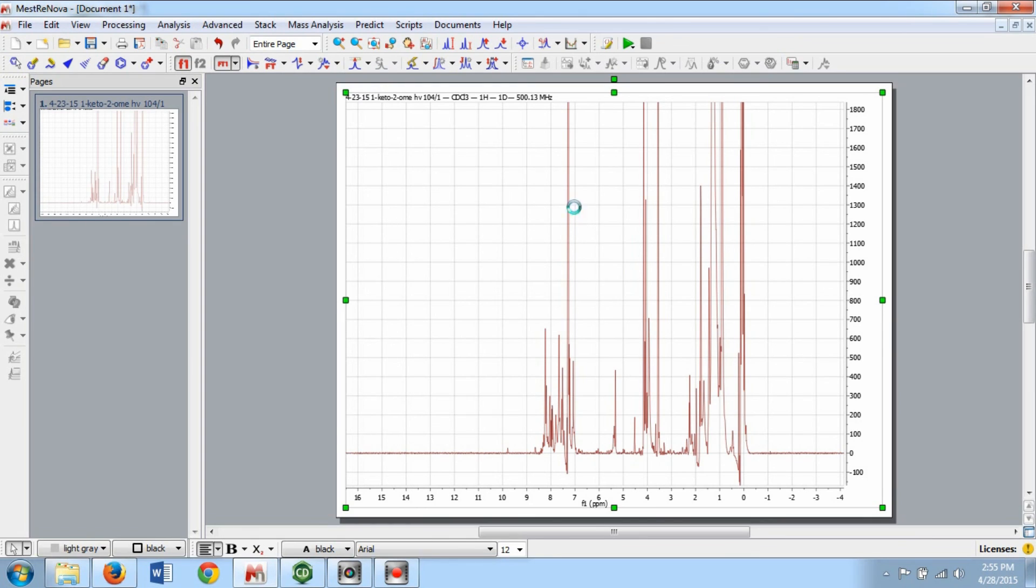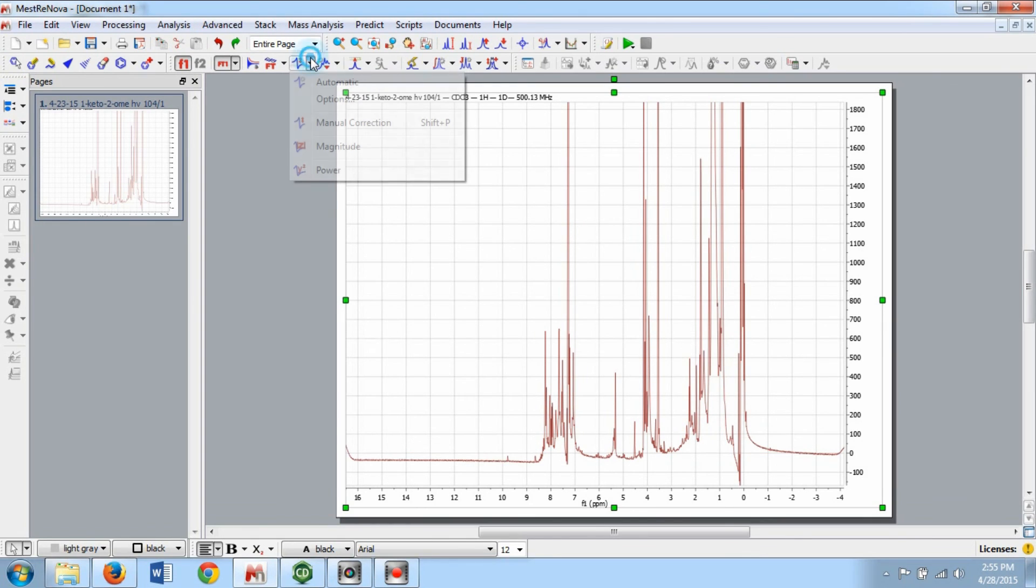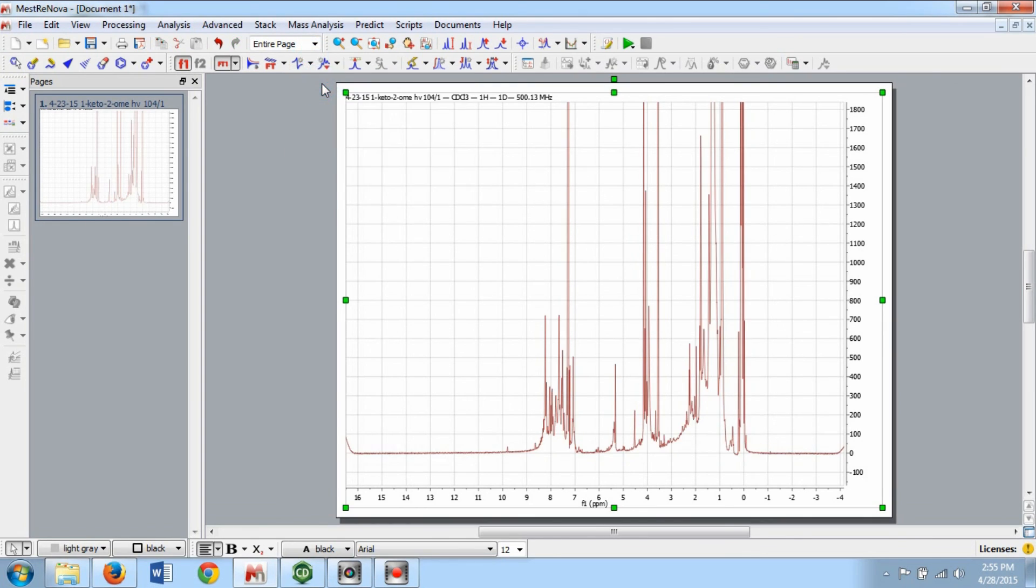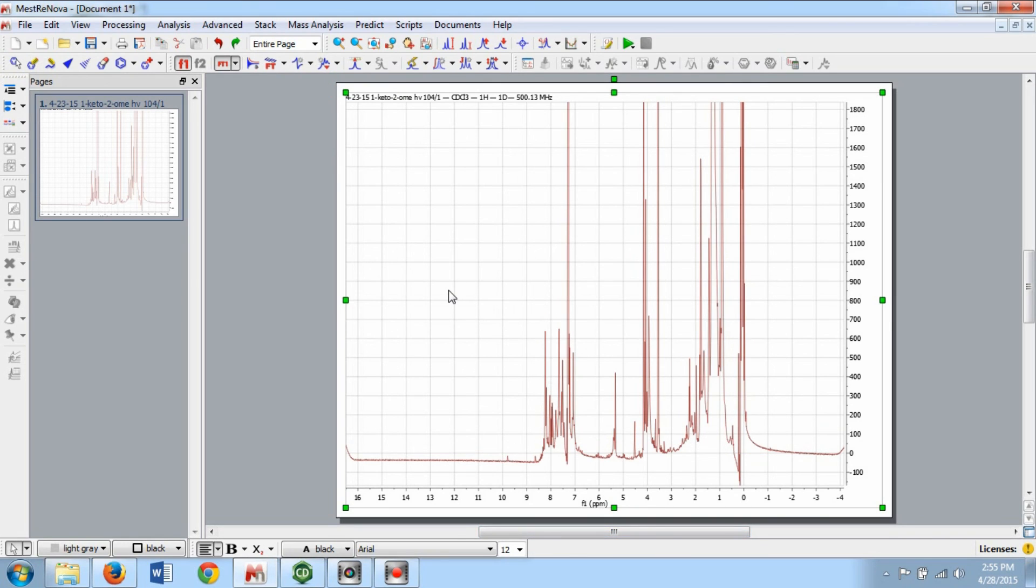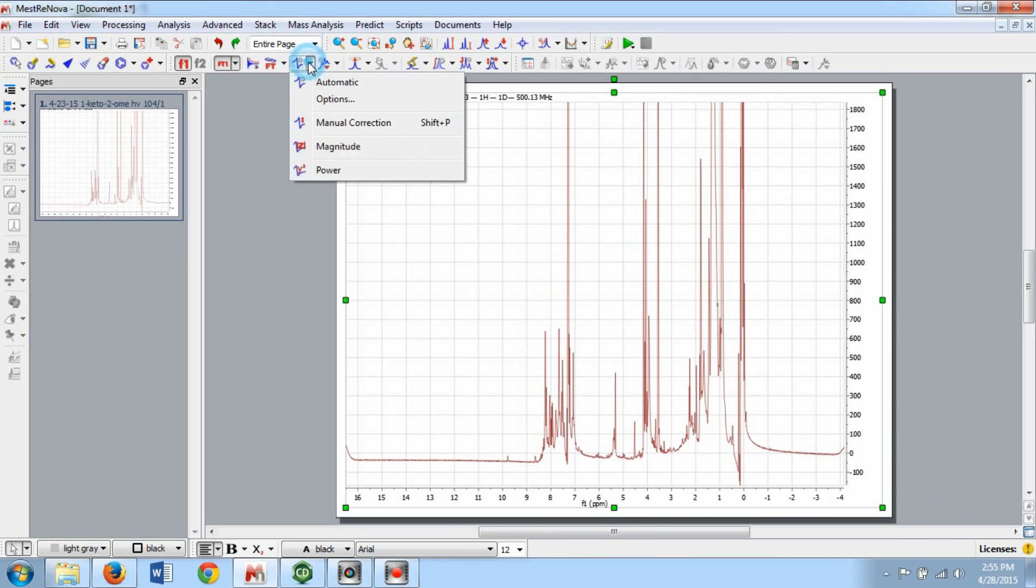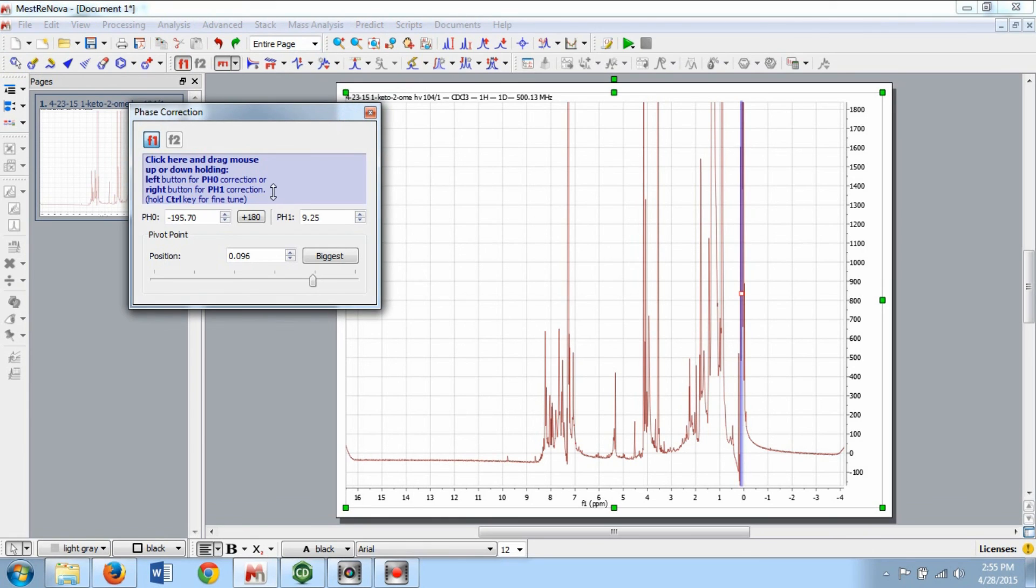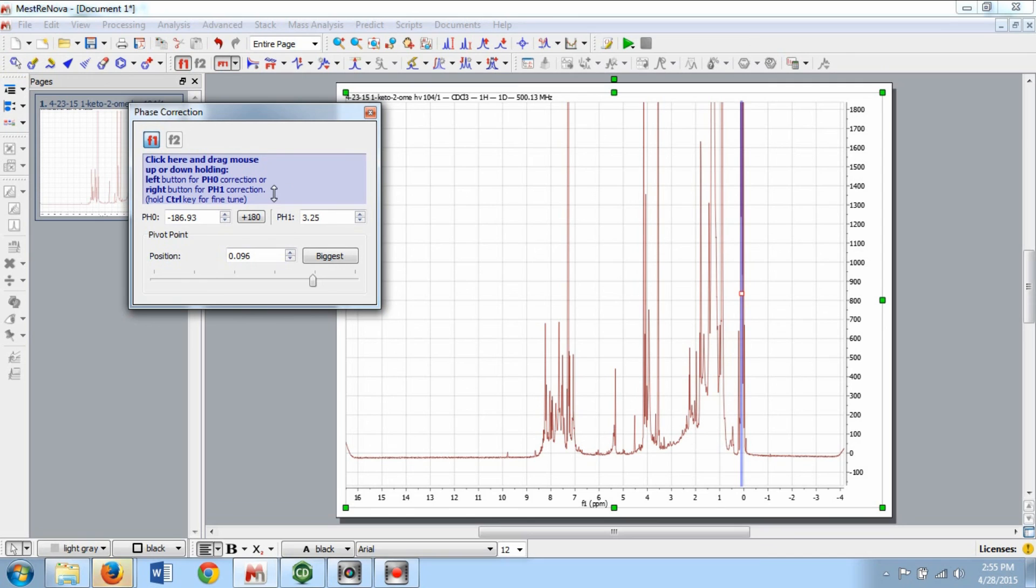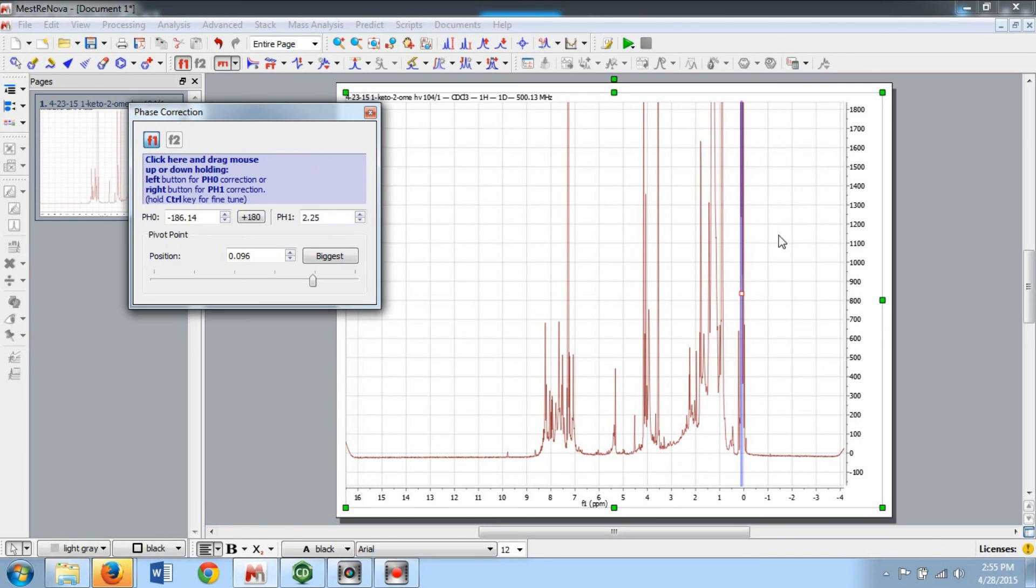Phase Correction can be done automatically or manually. Automatic Phase Correction is found under the Phase Correction options. Manual Phase Correction, found under the same menu options, is operated by either left-clicking or right-clicking in the blue text and dragging up or down. If necessary, you can adjust the pivot point by left-clicking on it and dragging left or right on the spectrum.